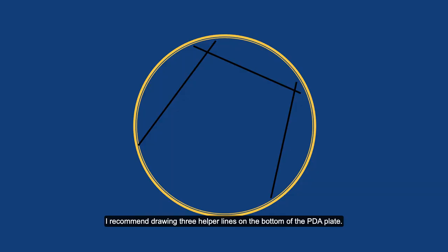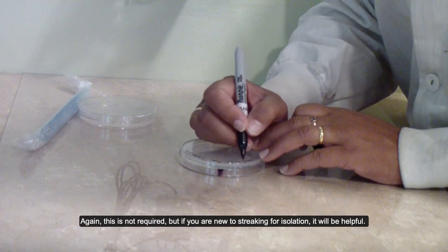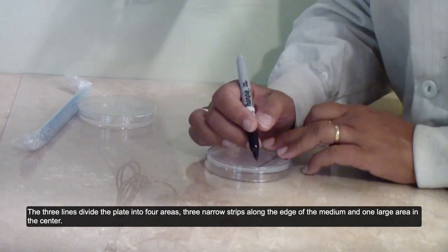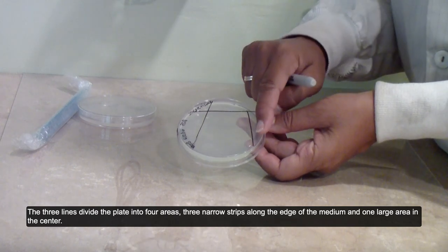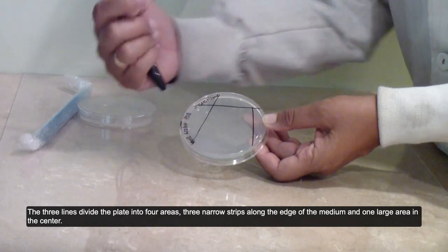I recommend drawing three helper lines at the bottom of the PDA plate. Again, this is not required, but if you are new to streaking for isolation, it will be helpful. The three lines divide the plate into four areas: three narrow strips along the edge of the medium and one large area in the center.